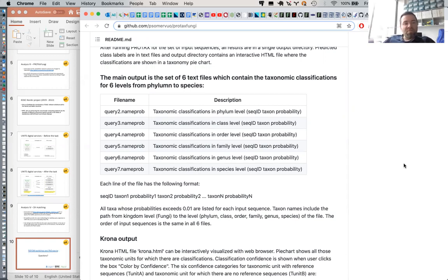So the question is, do you know to what extent these computing clusters are used for such kinds of tasks? Do you mean computing clusters as such, or regarding our programs? Yes, those programs that you have established, how often are they used over these computing clusters?